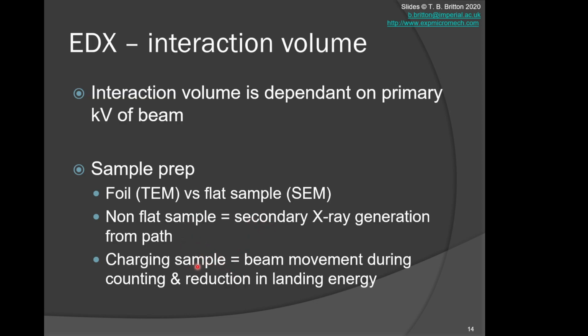The second point is that if the beam is charging on the sample, then the beam gets deflected, and of course the scattering then goes through material you weren't expecting. And also the other point is it will change the landing energy, so it will change what it can excite inside the material.